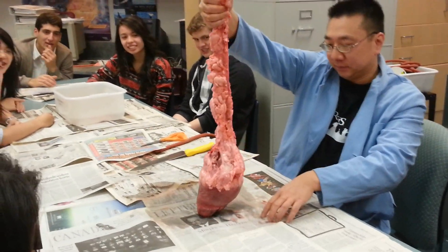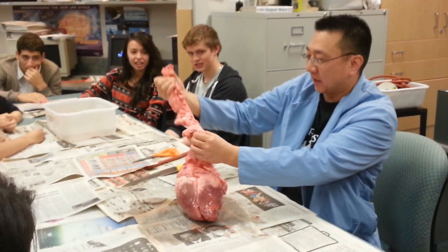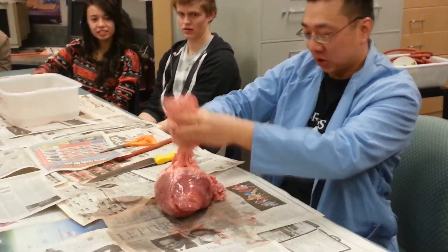I'm hanging on to the aorta. And this thing is vegetarian and look at all the fat on the aorta. It's all fat. It's all for protection.